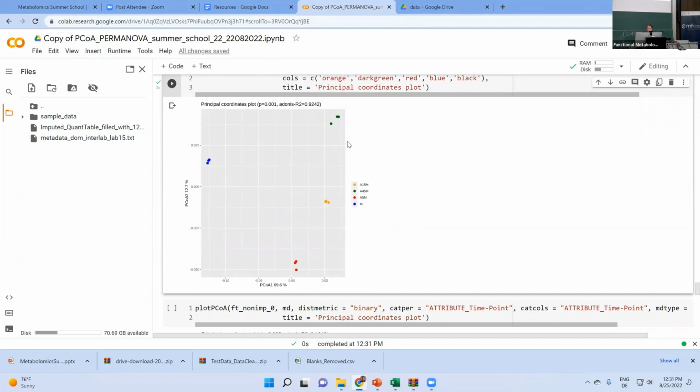And you can see here the difference is even more drastic, it seems, and 92% of the variation can now be explained by these different concentration groups. So one way I think one could interpret that is that there is not only a quantitative difference between those different samples, but there is in fact a qualitative difference. Which makes sense, I guess, if the more algae you have in your sample, the more different compounds will also be produced.